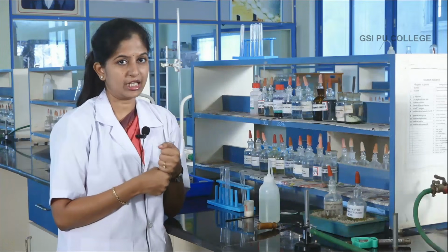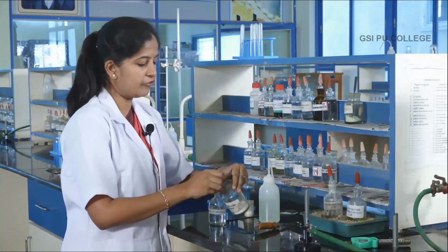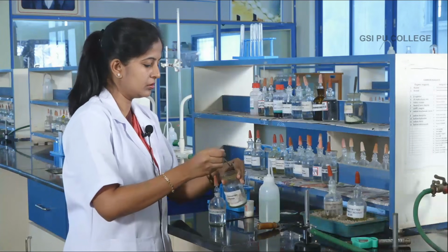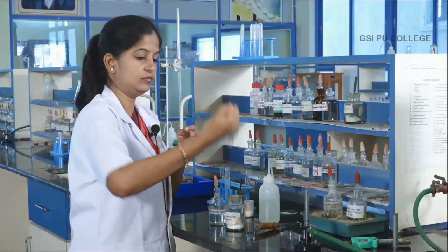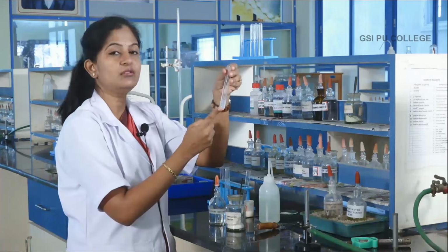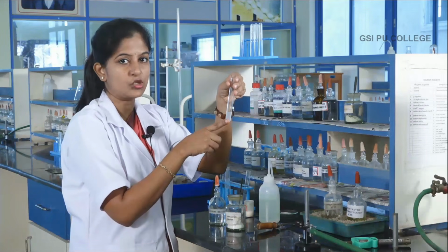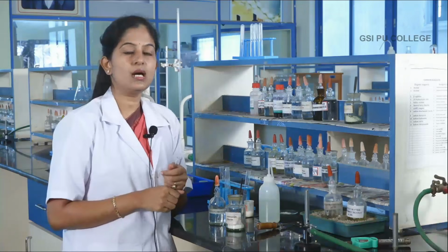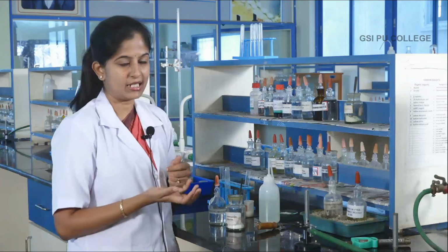Now we have to move on to the third group basic radical detection. So, decant a small amount of original solution, add a pinch of ammonium chloride salt, completely solubilize the ammonium chloride first, then add ammonium hydroxide. You can observe that there is no precipitation, hence the third group basic radical is also absent. Since the third group basic radical is absent, move on to the fourth group basic radical analysis.